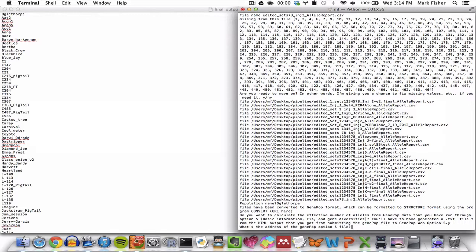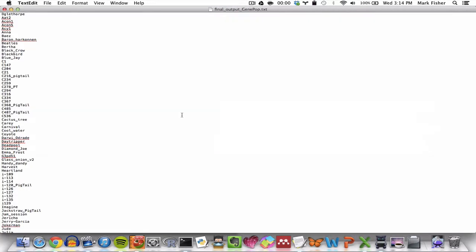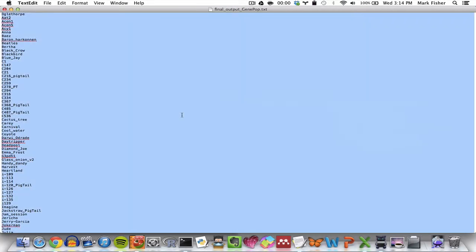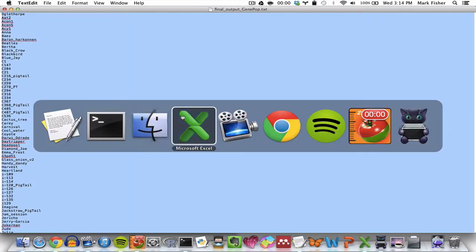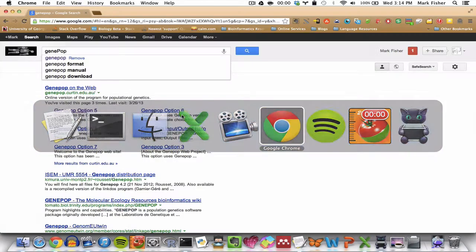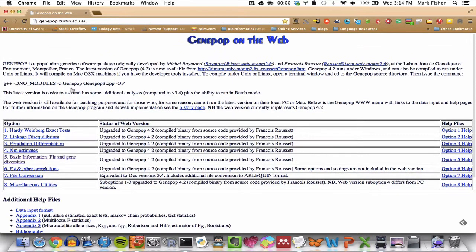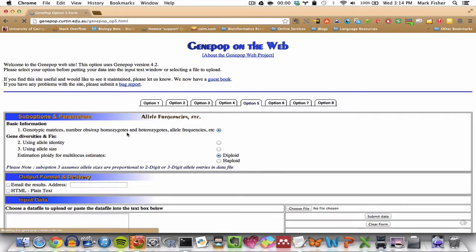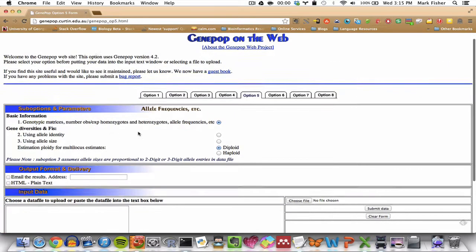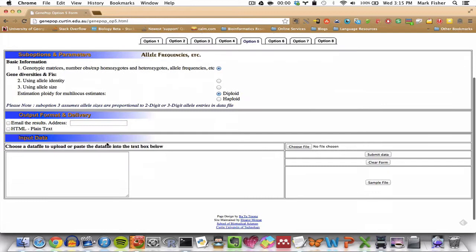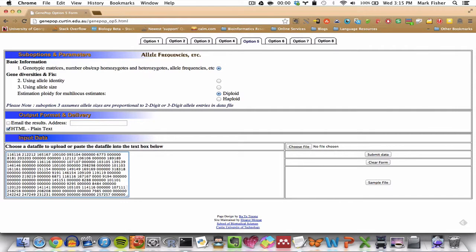And you'll then have to submit the data from FinalOutputGenePop.txt file to GenePopOnTheWeb, option 5, suboption 1, opting for the HTML plain text format of output from GenePop. So what we do here is we take these data, copy them, go to GenePopOnTheWeb, which you can get just by Googling GenePop, GenePopOnTheWeb, go to option 5, suboption 1, HTML output format. We just paste the data here. Click Submit.